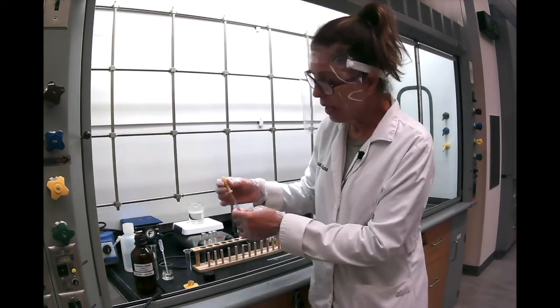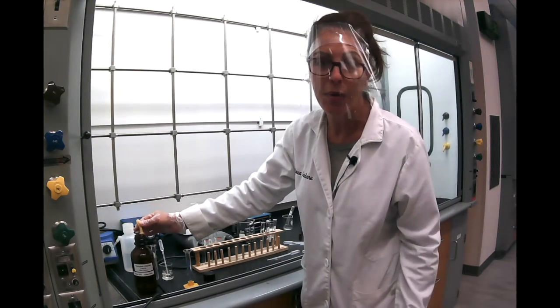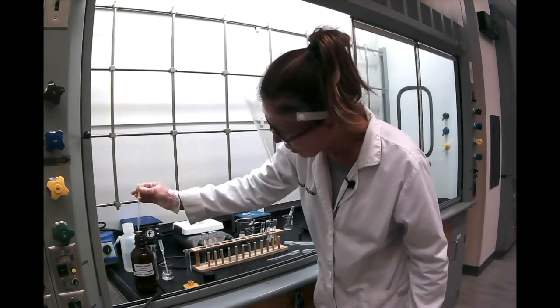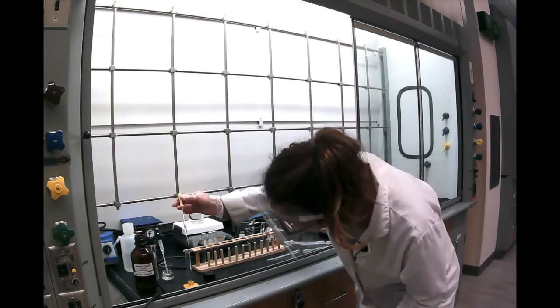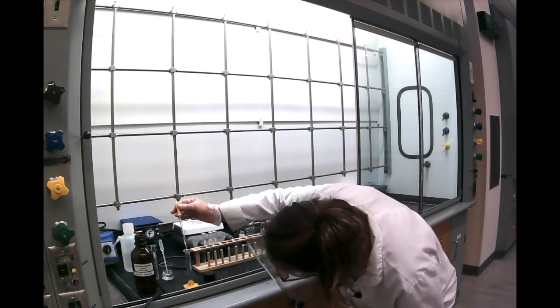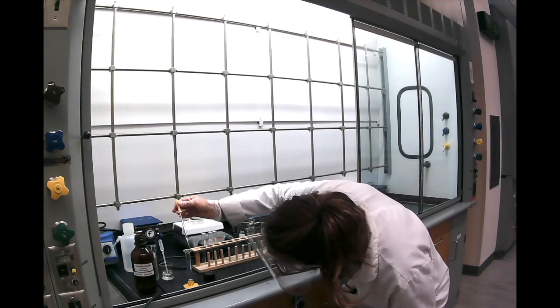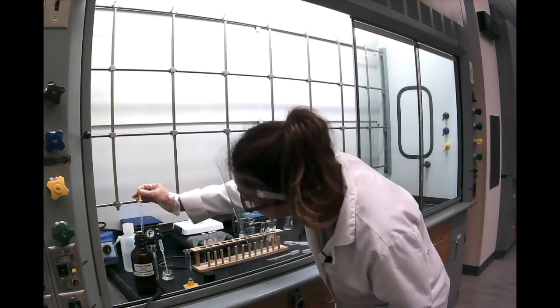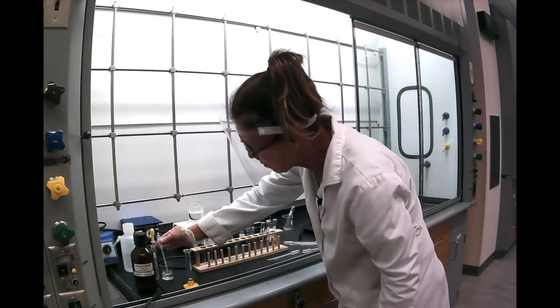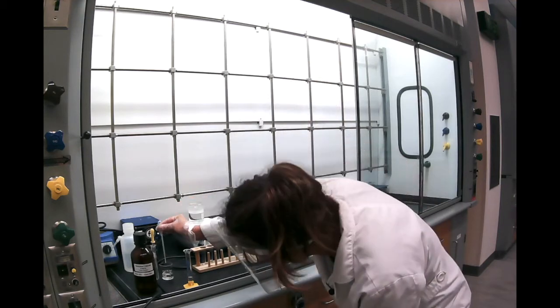Now for methylene chloride, make sure you use the glass pipette, because methylene chloride can dissolve the plastic because they both have similar polarity. So you can use a graduated cylinder and measure roughly 2 milliliters. So I'm putting here 2 milliliters on my graduated cylinder. And that's about 2 milliliters. And then I can do the same with water. And water is roughly 1 pipette full. I can add it to the graduated cylinder just to be sure.